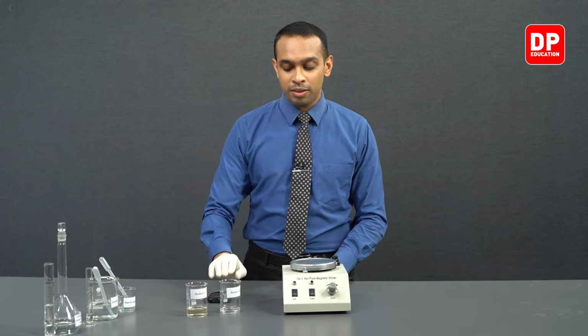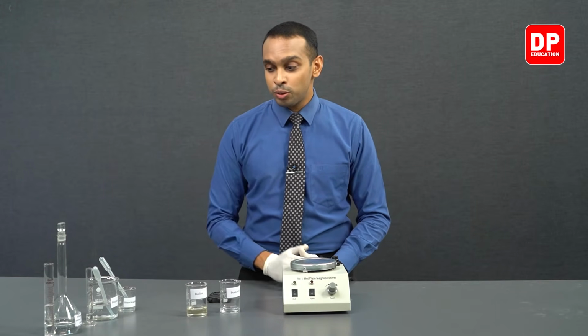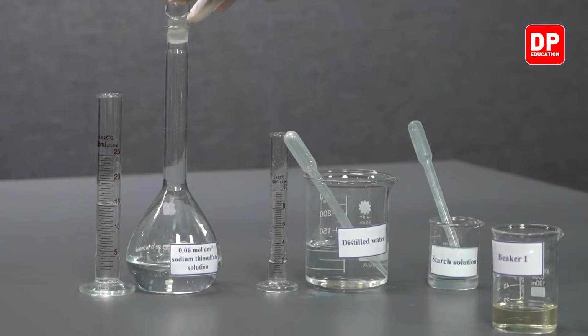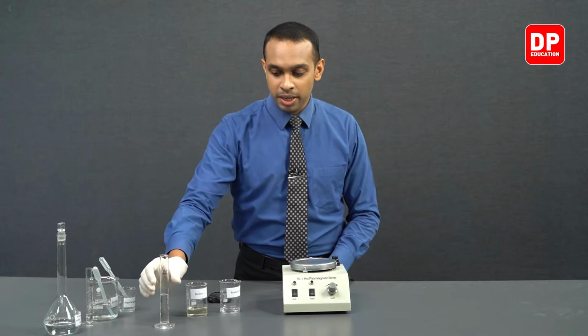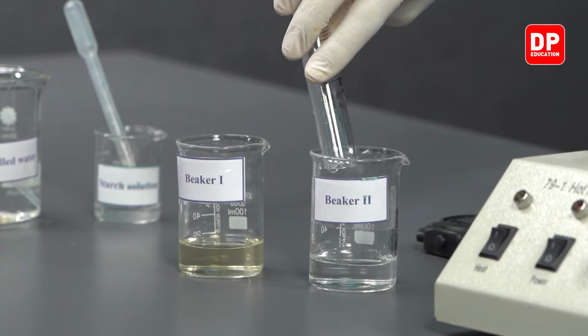So potassium iodide, we have only taken 8 cubic centimeters here, and as you know, like we did in the previous parts, we have to add 15 cubic centimeters of sodium thiosulfate. So we have already measured 15 cubic centimeters of sodium thiosulfate here, and we will be adding that to our potassium iodide solution.